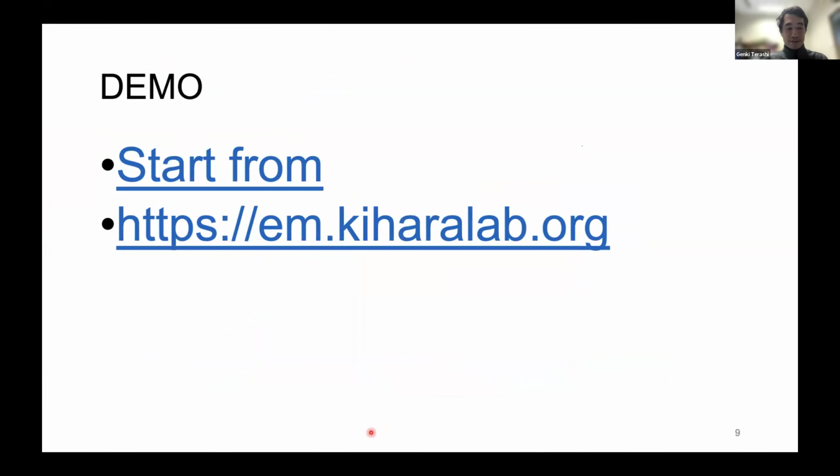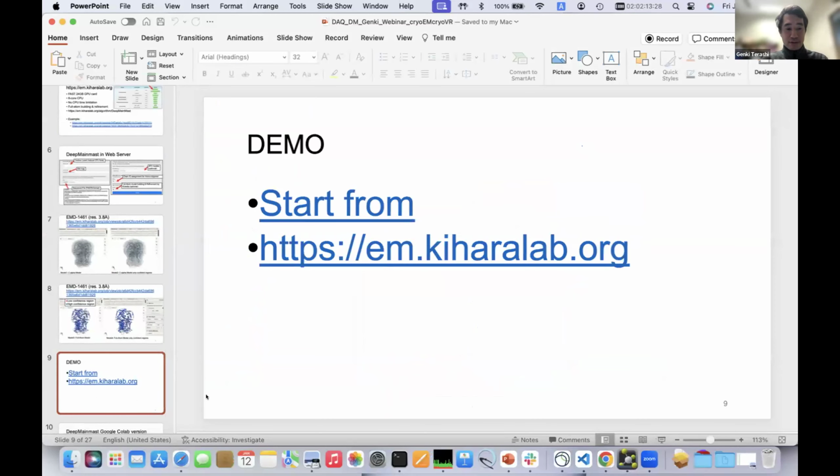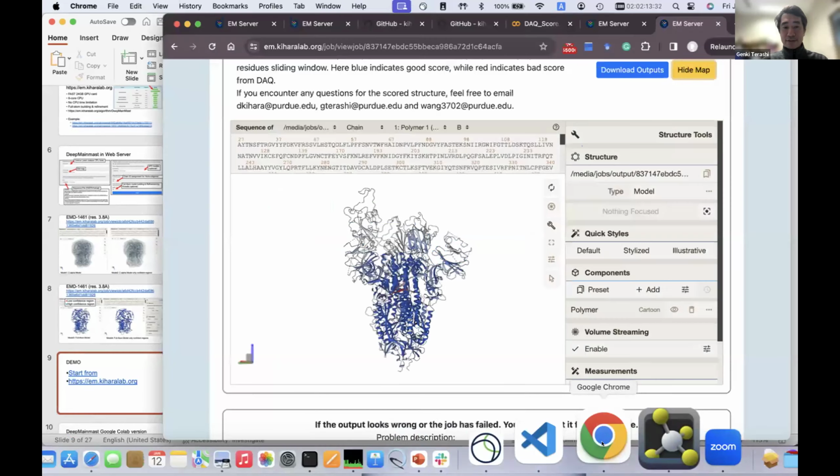Okay, so I've shown how to use this web server. Now I will demonstrate on my browser.